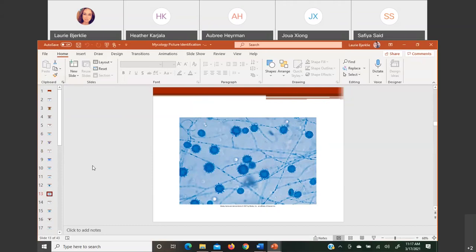Yeah, so this is another dimorphic fungi. Good, a systemic infection. All the dimorphic fungi can cause a systemic infection. So Histoplasma capsulatum. The key is the rough, tuberculated look to it. They like to call it tuberculated, I just say rough. Macroconidia, kind of spiky looking almost.